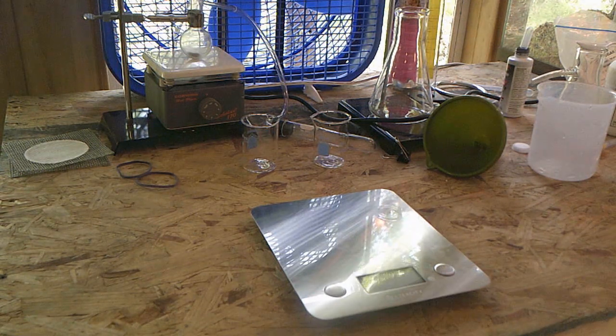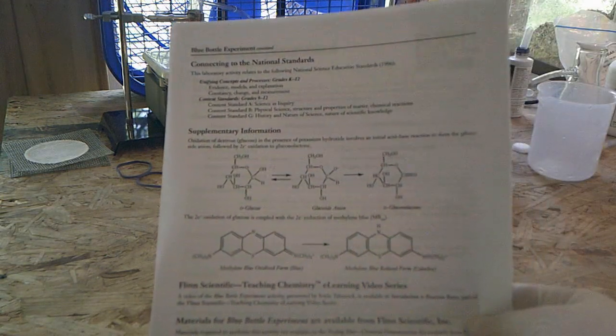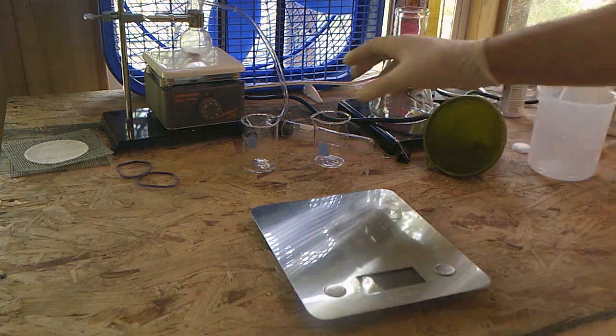Let's see if I can get this to show up on camera. Here is the organic chemistry version of this reaction. What we're going to be doing is basically moving hydrogen around and attaching hydrogen to oxygen or attaching it to different parts of methylene blue, which is the chemical we're going to use that changes color. And it changes color due to this redox reaction. So let's start with our first chemical.